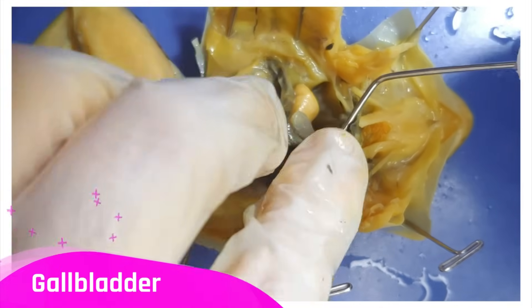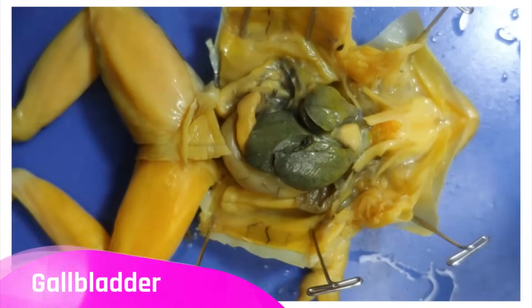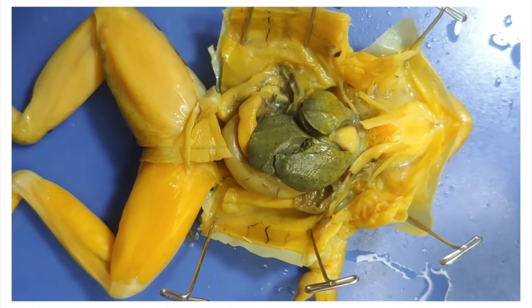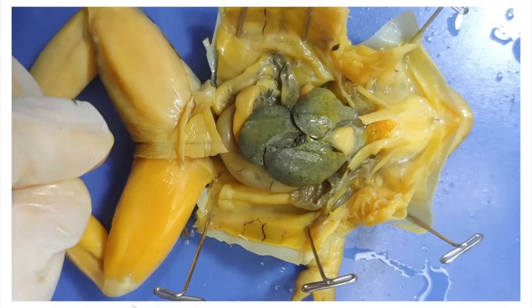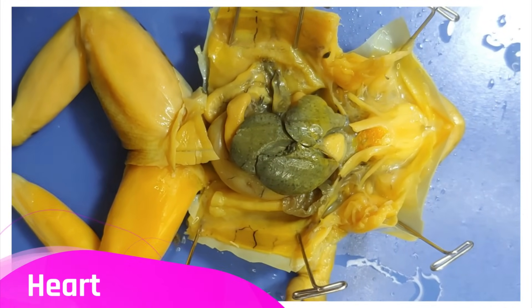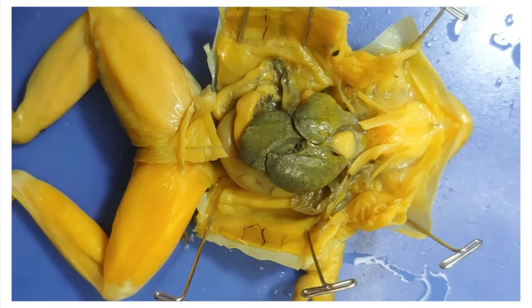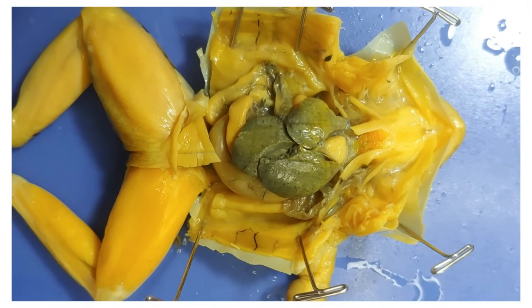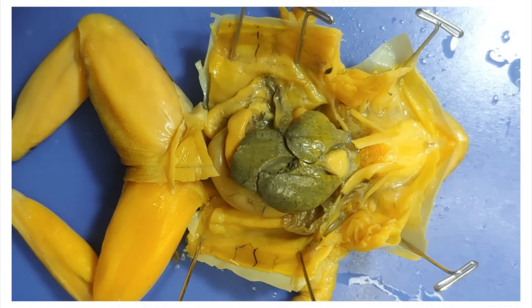Below the liver is the gallbladder, which stores the bile that the liver produces. When I move the liver aside, you'll see the heart. Amphibians have a three-chambered heart, which means it has two atria but only one ventricle. The disadvantage of this is that oxygenated blood and deoxygenated blood can mix, which reduces efficiency.